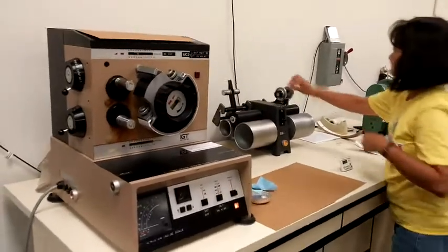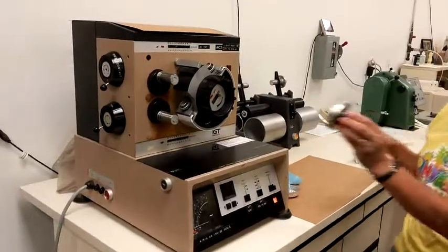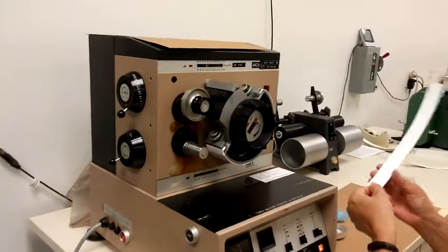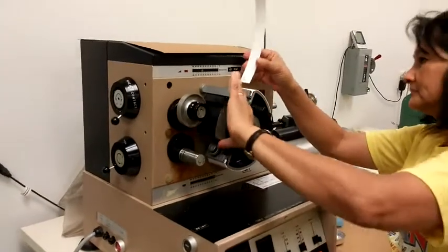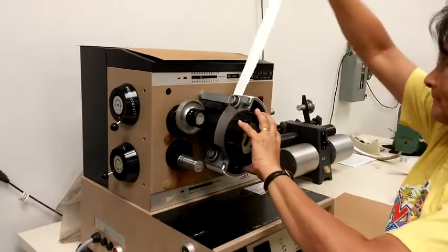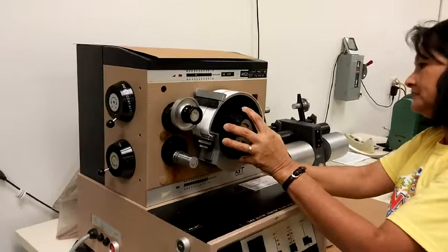The IGT pick and blister test measures the ability of coated or uncoated paper or paperboard to resist picking or blistering during offset printing. The test device operates by applying a known film thickness of polybutine oil at a given viscosity to an aluminum printing disk.